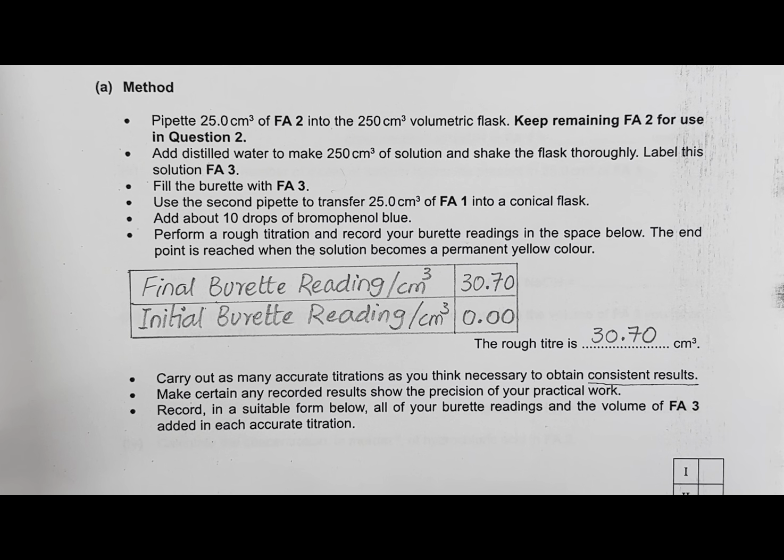But if any deviation is happening, like more or less volume is used up in different titration results, consistent result means less than or equal to 0.10 centimeter cube. If your two values lie within this range, they are assumed as consistent results.